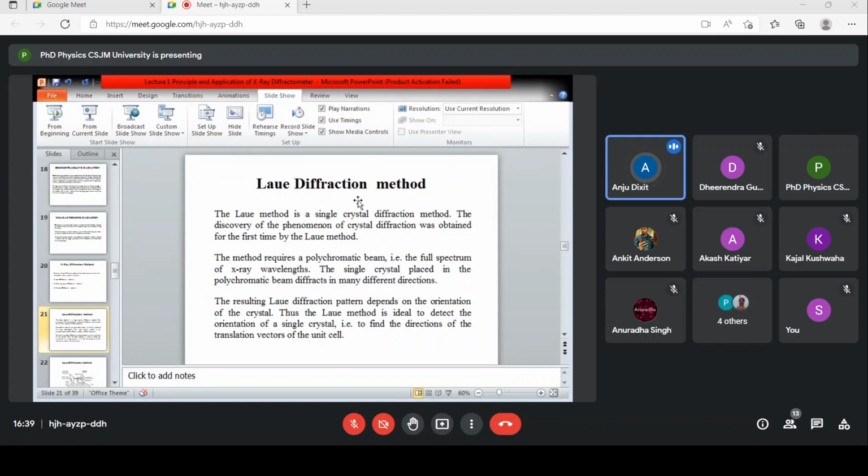तो इसमें प्रोसेस पाउडर डिफ्रैक्शन मेथड से बिल्कुल एंटायरली डिफरेंट है. जो एक्सरे डिफ्रैक्टोमीटर हमने दिखाया वहाँ हमने बताया कि मोनोक्रोमेटिक बीम यूज की जाती है, क्योंकि मोस्ट ऑफ द टाइम हम पॉलीक्रिस्टलाइन सैंपल का एक्सरे ले रहे होते हैं जहाँ बहुत सारे प्लेन्स की पॉसिबिलिटीज होती हैं, तो वहाँ एक सिंगल एक्सरे वेवलेंथ सैंपल के साथ इंटरेक्ट करती है और डिफरेंट प्लेन्स को डिटेक्ट करती है. यहाँ जस्ट अपोजिट है, यहाँ हम सिंगल क्रिस्टल का ले रहे हैं. जब सिंगल क्रिस्टल के लिए हमको एक्सरे डिफ्रैक्शन मेथड की जरूरत होती है तब हम इस मेथड को यूज करते हैं. तो इट इज वेरी स्पेसिफिक मेथड, सिंगल क्रिस्टल के लिए इसको यूज करते हैं.